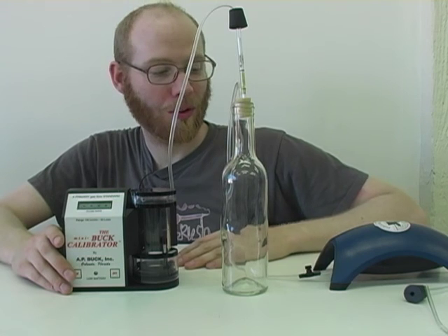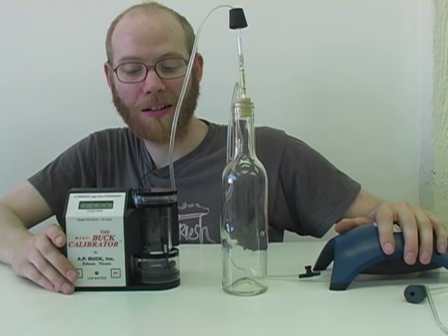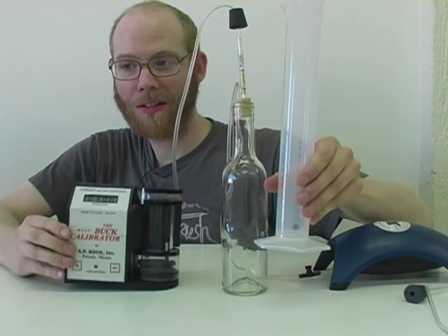We're ready to run this pump as a formaldehyde tester, and we've calibrated the pump with equipment that costs ten dollars instead of a thousand.